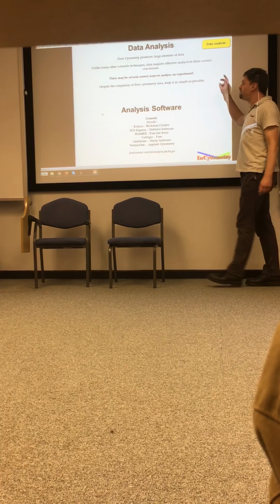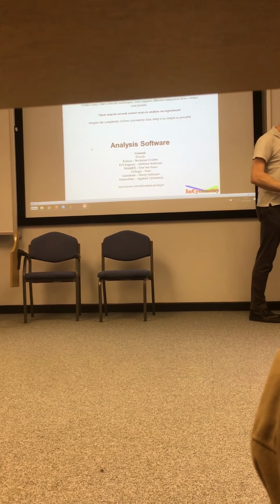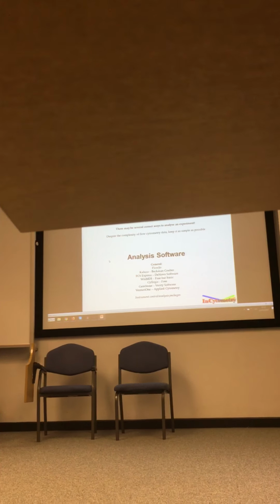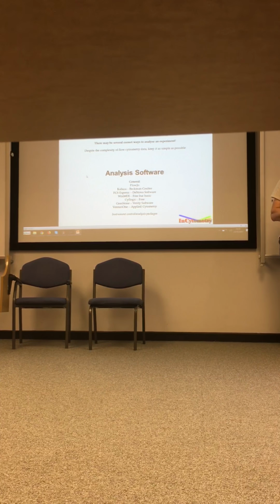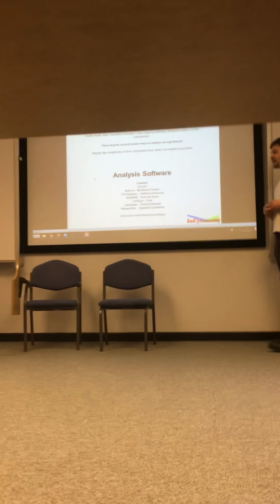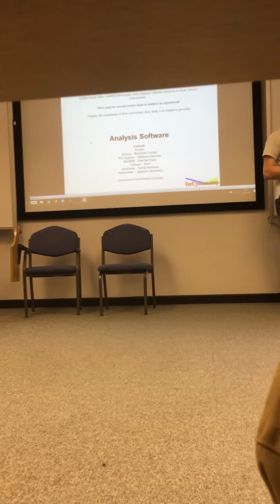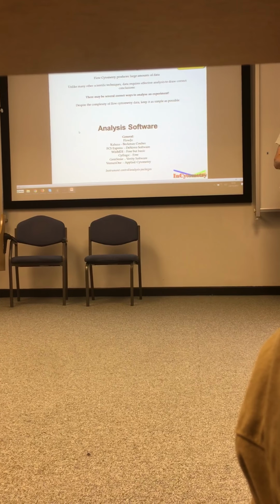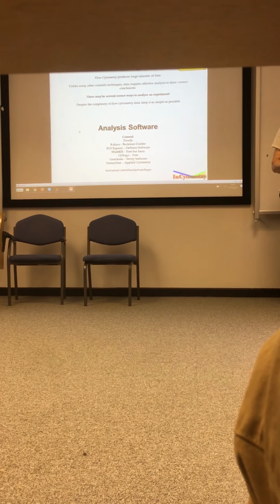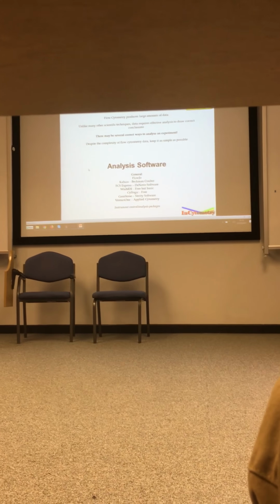And I've put here, there may be several correct ways to analyse an experiment. Now the reason I put that is, when I was writing this, I thought back to my early days in cytometry, and the postdoc in the lab who taught me how to operate the machine, or buttons to press really. And I remember showing him my analysis, which was relatively basic actually at the time. I showed him my analysis, oh no, you don't do it like that, you do it like this and this. And thinking back, I now realise that actually what he meant was, no, that's not the way I'd do it. I'd do it this way. It's not the same thing.